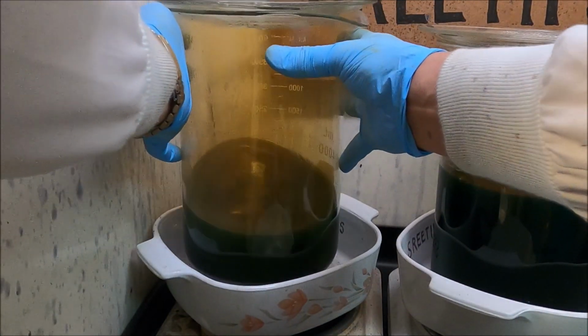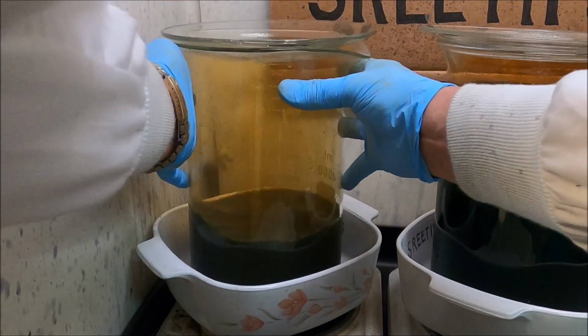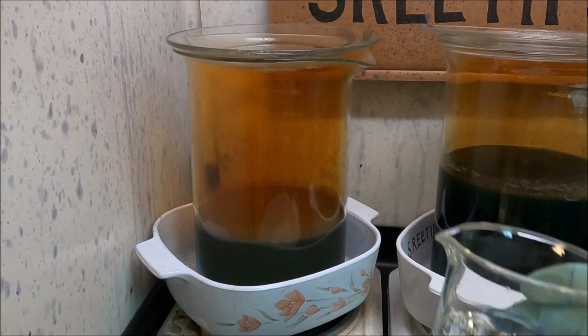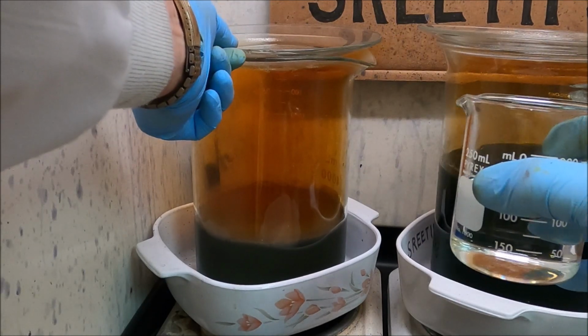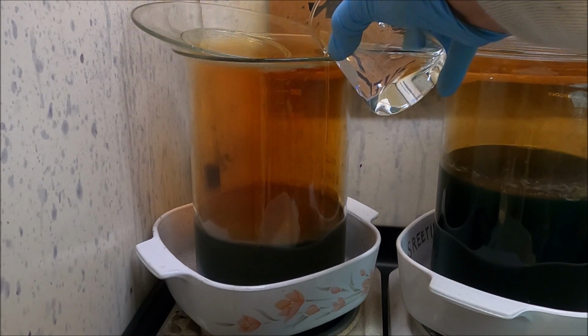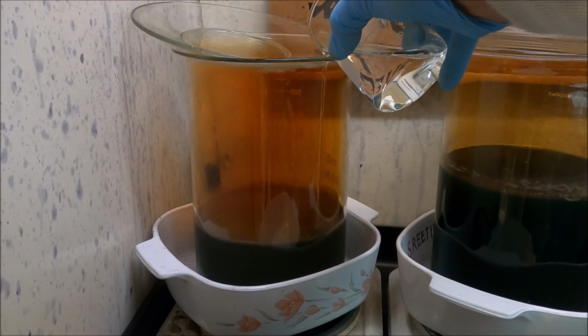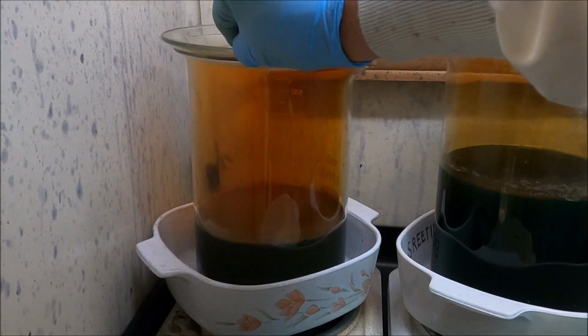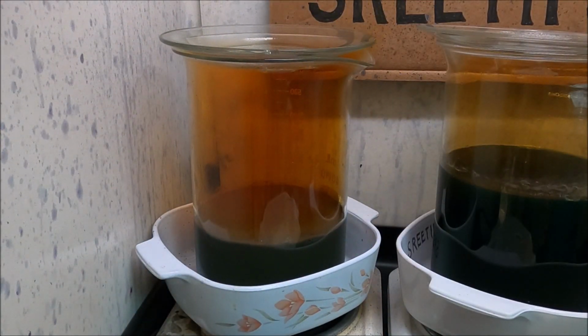Swirl here. See if we can get that mixed up a little bit in there. Alright, I don't think that's too vigorous there. I'm going to add a little bit more of our acid. Let this continue to heat like this and react with the acid that's in there with the finely divided solids.